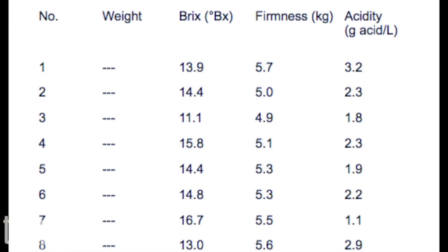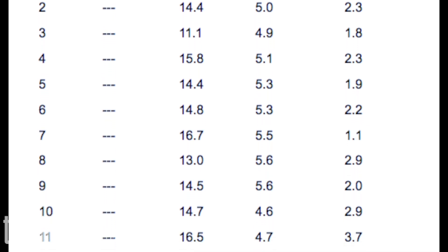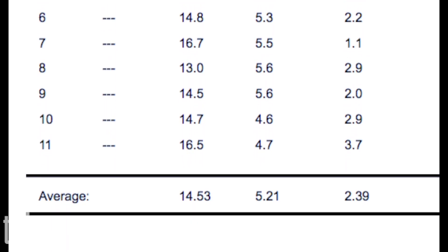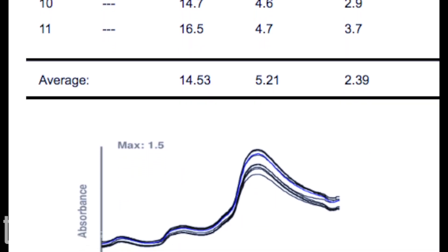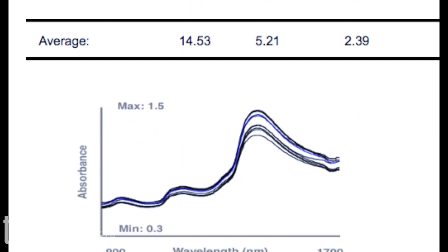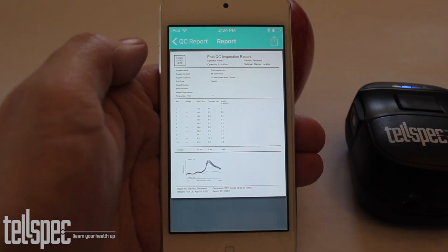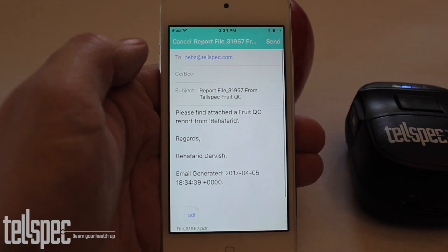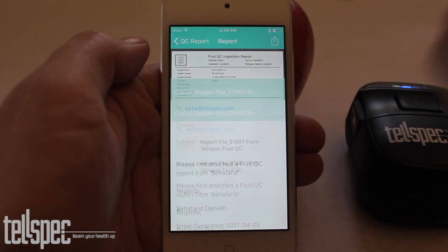We can fill out the questionnaire and then generate a report. Among the information gathered we have brix, which involves the sugar levels, firmness, and acidity. All of these amounts come together to tell us how sweet and how ripe the fruit is. We also show the spectral data. The report can easily be sent to other people — simply tap the button, fill in any information needed in your email, and then hit send.